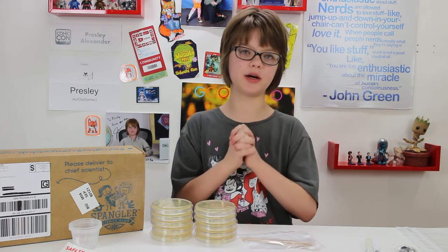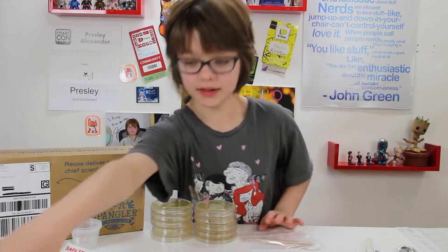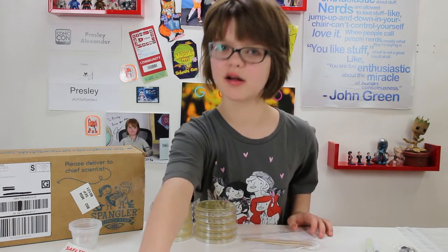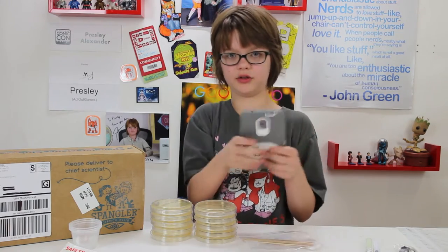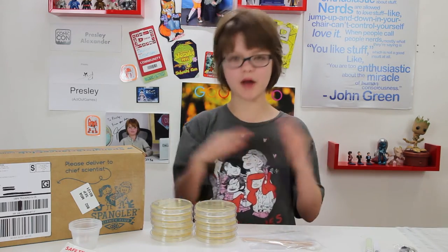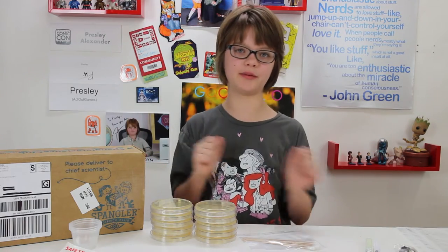So let's start by taking swabs from those four things: my hand, the TV remote — which is going to have a lot because it's been touched a lot and obviously doesn't get washed often — my phone case, which I touch all the time, and then the refrigerator door handle. Then we're going to clean those things in different ways and see which way is more effective to get rid of bacteria.